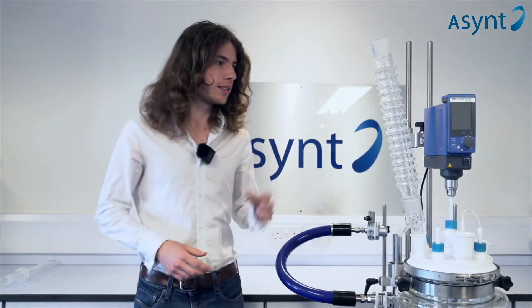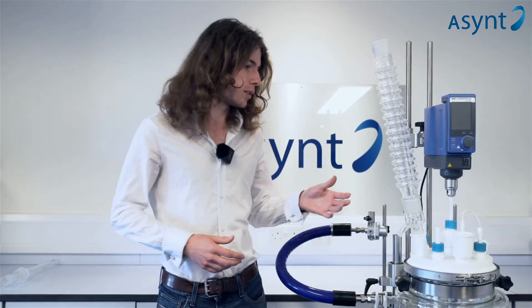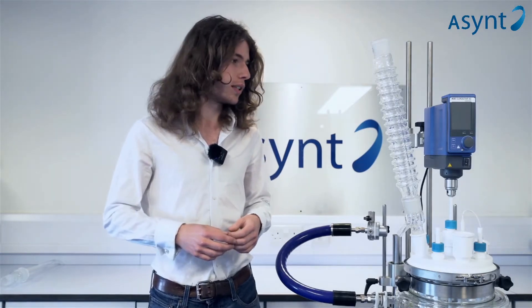Hi, I'm Cameron from Asynt. This is our Condensing Maxi. It's based on our original condensing, with a similar outer layer, but it's designed for reactions over one litre.